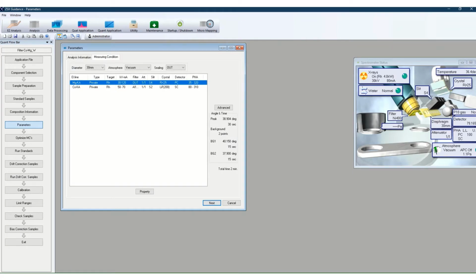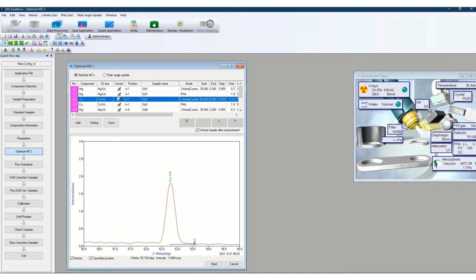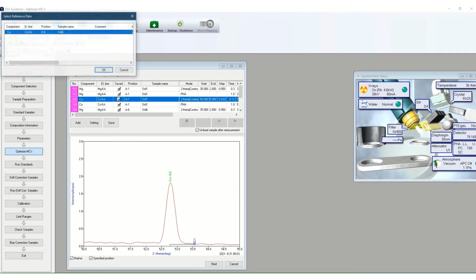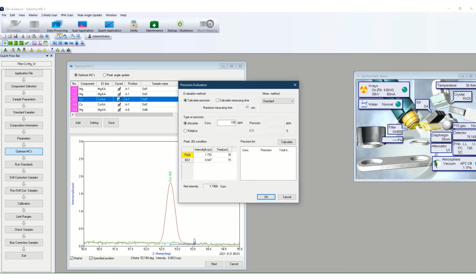So the parameters are crystal, the counting time, background points. What we do with these scans is we determine where these are. So we just run quick scans. We can overlay them with a low material. Here's with cobalt. So here's our high. That's going to be compared to our low, and so you can see that in green here. We pick a background point. We pick the peak position, and then what we do is we collect counting time.